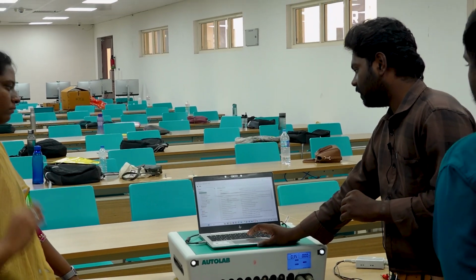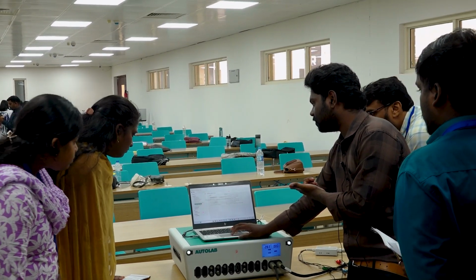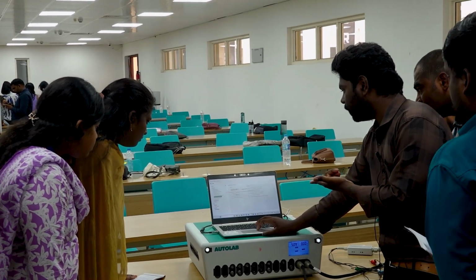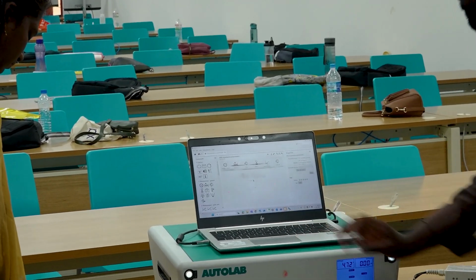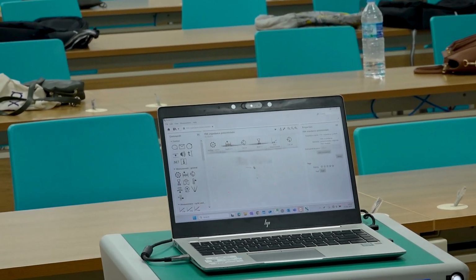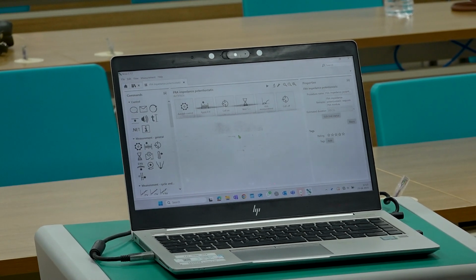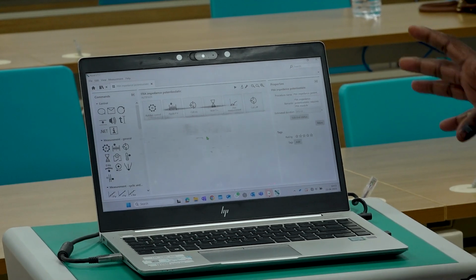Okay. So here, this is the impedance spectroscopy technique. The software is Nova software. This is impedance spectroscopy. Here you can see impedance, FRA impedance potentiostatic. Okay. So this is the date. This software has a default technique. Okay, no need to modify much actually. It's almost an optimized technique.